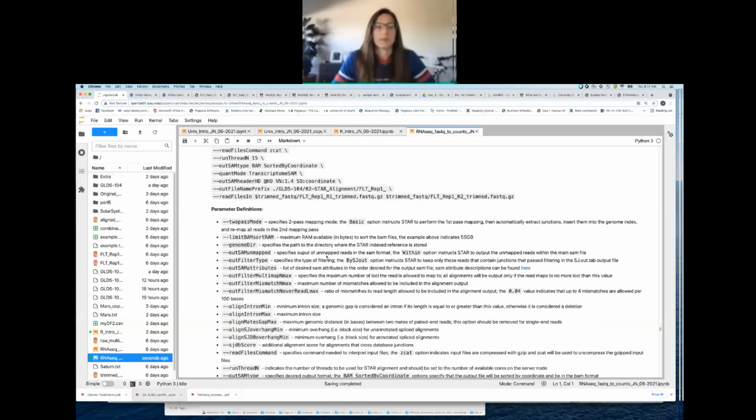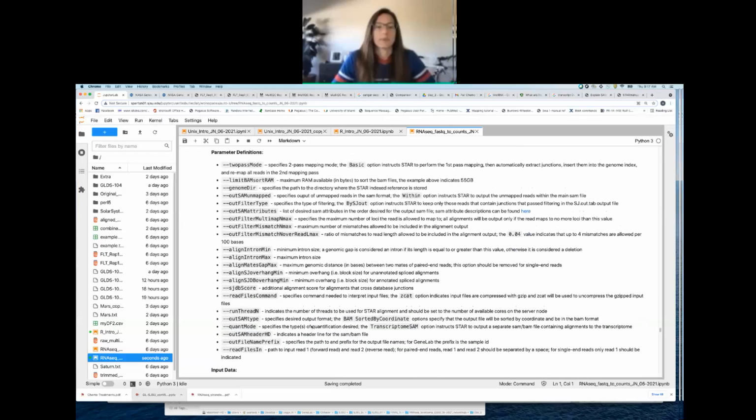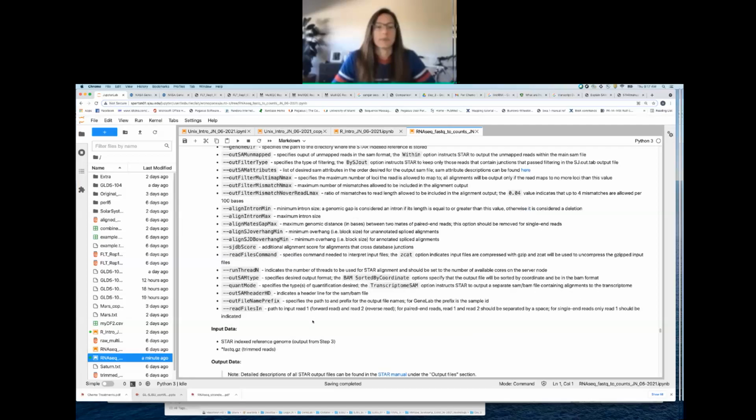And again, I have definitions for all of those options here. So I guess I'll open this up now. If any of you took a look at the definitions of all of these options, I just want to give you an opportunity to ask questions about any of the definitions. It might not make sense to you. It's okay if you haven't had a chance to read through all of them yet. I know we've been going over a lot. If you do happen to read up on these definitions and have any questions, please feel free to go ahead and ask me.